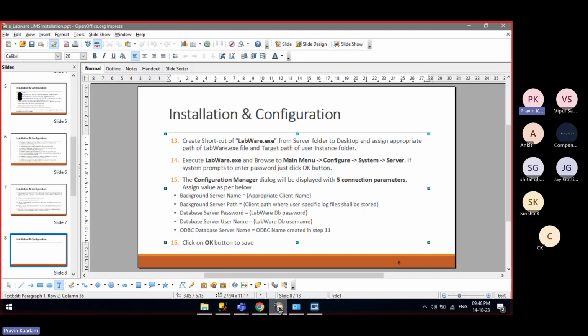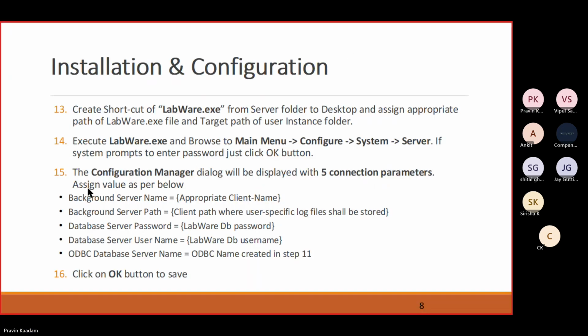Before we proceed, step number 14 is complete, and step number 15 also we completed. Here we configured the server connection and server configurations.